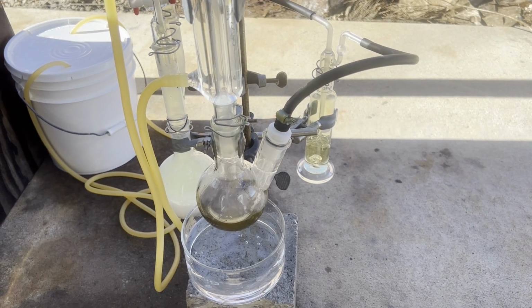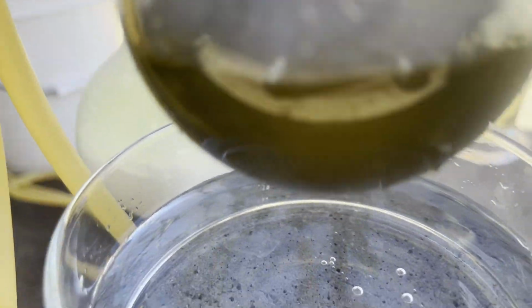The adapter that leads into the reaction mixture is made of PTFE, or Teflon, and is actually for thermometers, but I just used a 6mm glass tube. Yields could have been improved by using a fritted gas bubbler, but I don't have one.